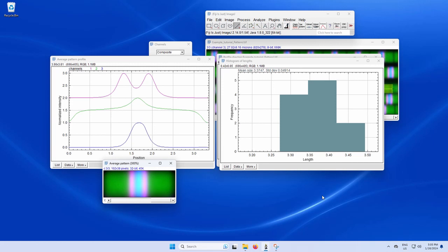When the analysis is done, a new file appears in the analysis folder. These files contain all the position of the features as well as some fit parameters used to extract the position of edges. These files can easily be opened in Excel, R, or Python for further analysis. With the tutorial image, you can, for instance, estimate the distribution of distances between the 2 bands in channel 1 or of the distribution of width of the blocks in channel 2.